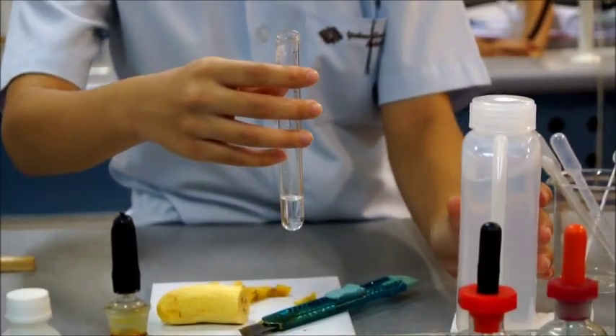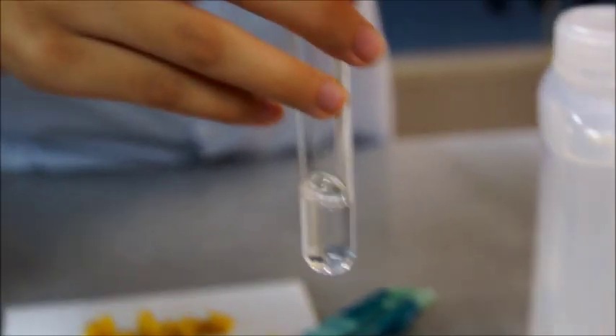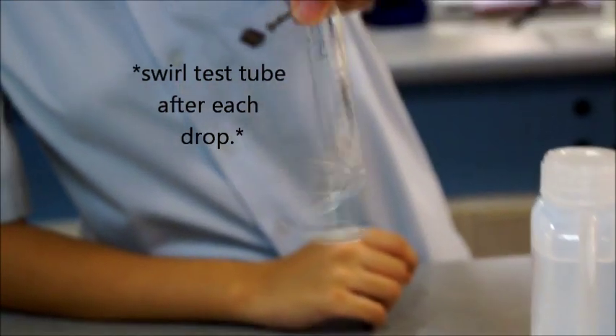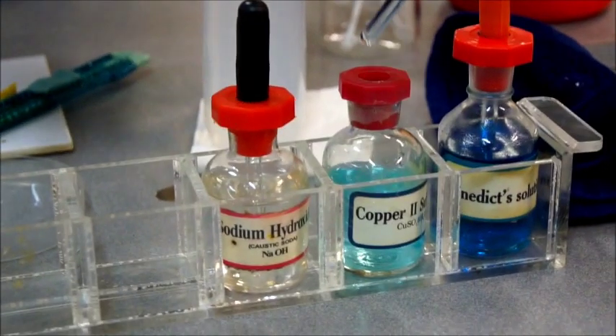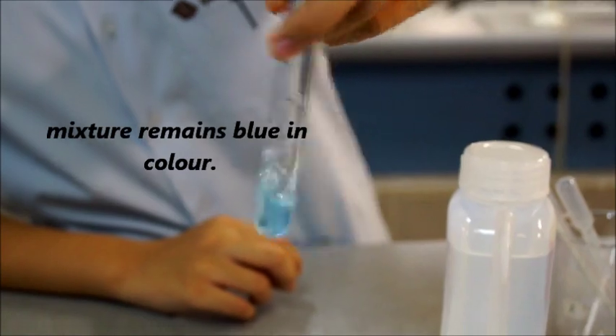Set up a control with distilled water instead of banana extract for the Biuret test. Add copper(II) sulfate dropwise and swirl the test tube after each drop. Make sure it remains blue in color.